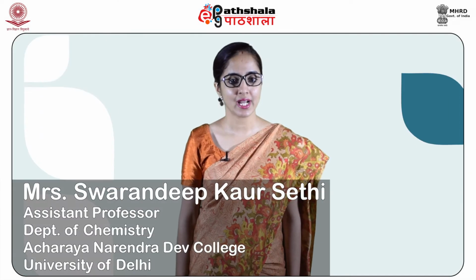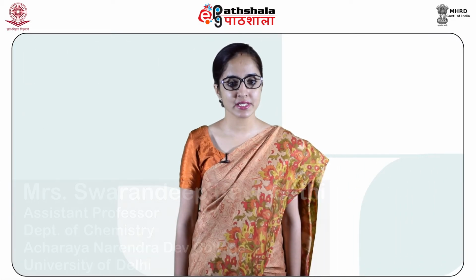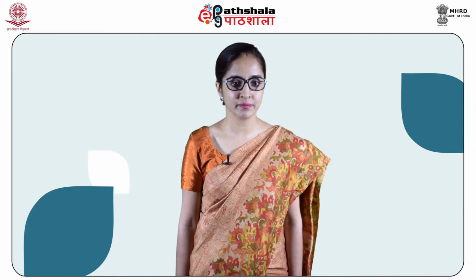Dear students, after studying this module, you shall be able to understand the importance of IR in detecting various functional groups and identification of substances, understand the progress of a reaction by using IR spectroscopy, understand how hydrogen bonding affects the absorption band, and understand how IR spectroscopy is useful in the detection of various kinds of isomerism.